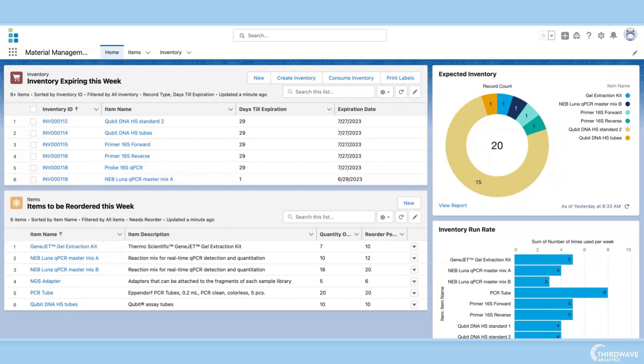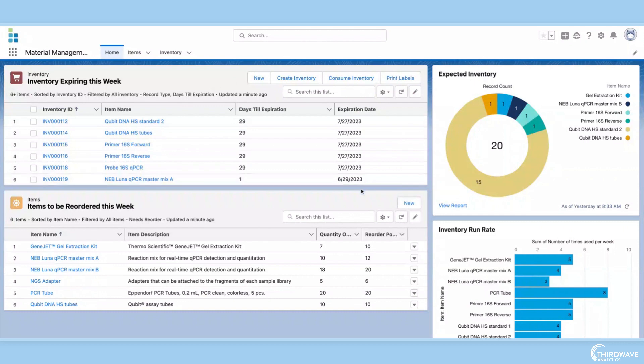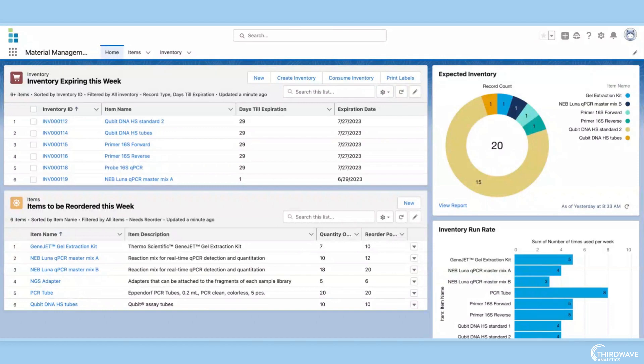Starting on the home page of the material management module, we can see reports and tables previewing important information, like what inventory is set to expire, what deliveries are en route, and what needs to be reordered. Your home page is completely customizable, so you can choose to see only the information that is relevant to you.